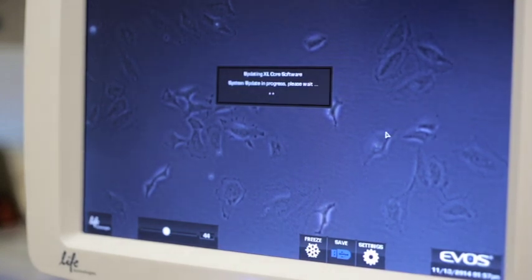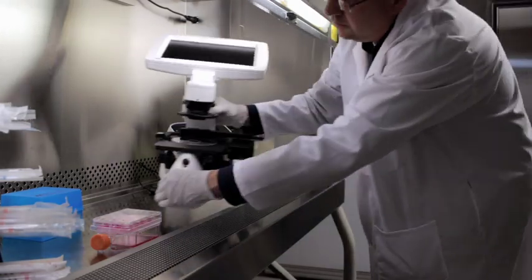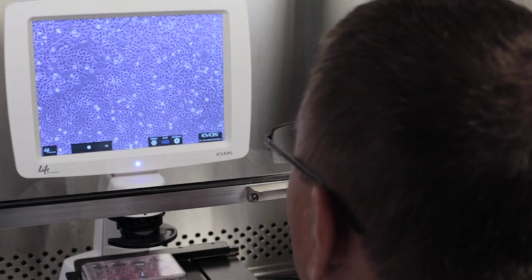The EVOS XL Core imaging system is the perfect instrument for collecting and capturing bright field images. Its small compact design is the perfect tool for imaging in the cell culture room or hood.